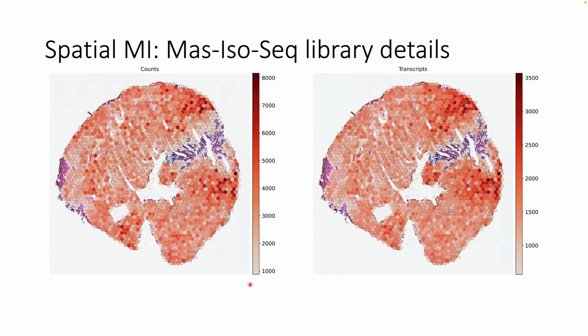And this is what it looks like. On the left-hand side, you have, by and large, the entire counts, so the number of reads per individual spot. This is only at near cell resolution because the Visium platform doesn't allow resolving individual cells. But what you can nicely see is that at the close-to-infarct regions, at the border zones, a lot more transcripts get expressed.